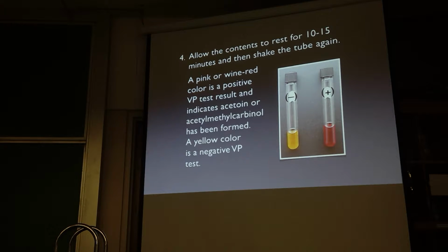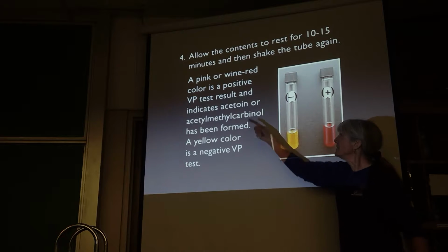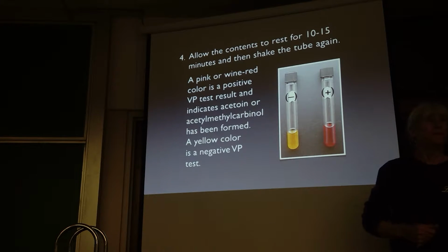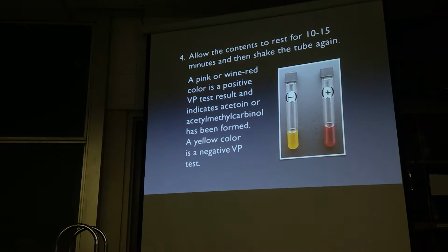Acetoin is not acetone, spelled funny and pronounced funny. It's not acetone. It's acetoin. It's a neutral fermentation product. It's also called acetylmethylcarbinol. So this and that are the same thing, but this is not acetone. Don't call it acetone. Okay. If it turns kind of a greenish yellow brown kind of ugly color, it's negative VP. So pink red is positive VP, yellow brown negative VP.